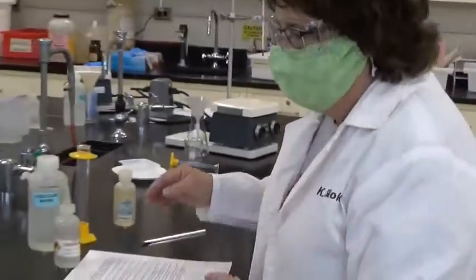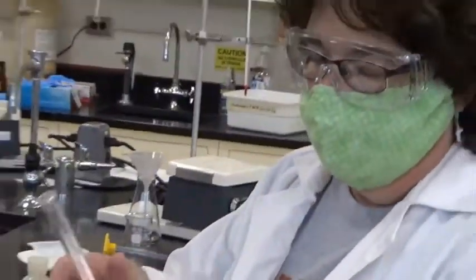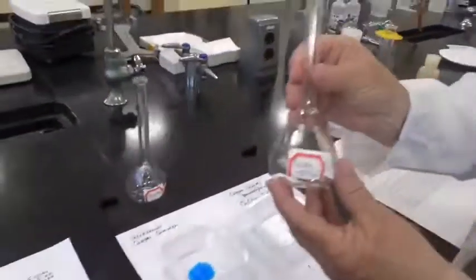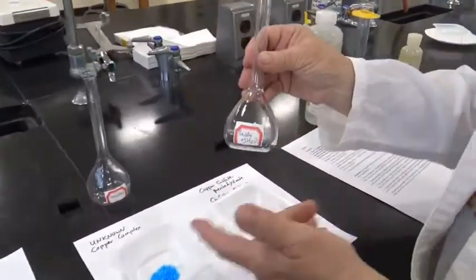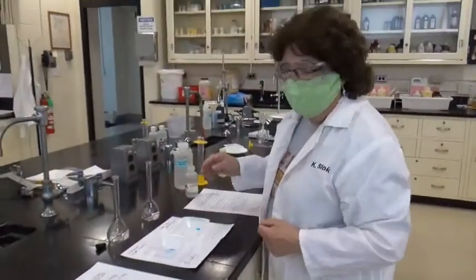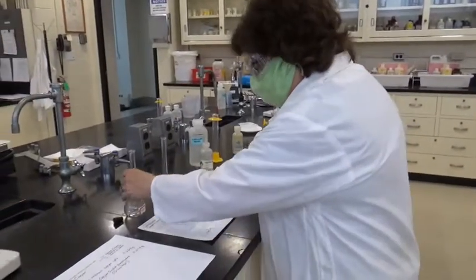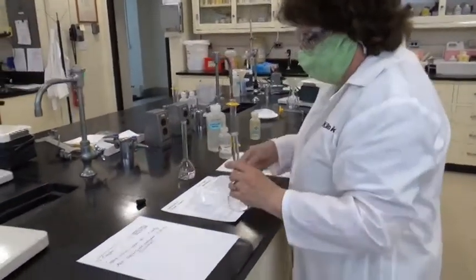Take it away. Okay, so the first thing you want to do is make sure that you know the unknown is labeled and the copper sulfate's labeled. You might say, why did we use copper sulfate? It's blue, that's why. And so is our unknown. So the first thing we want to do is make a solution. I'll make it with the unknown first.